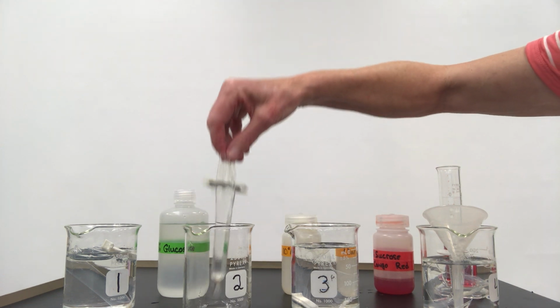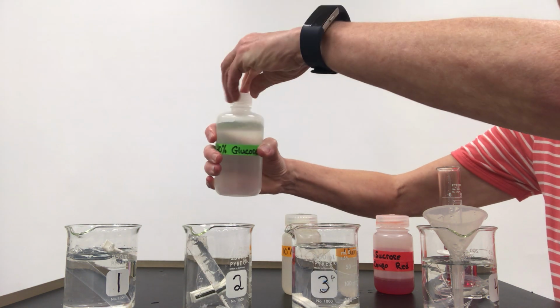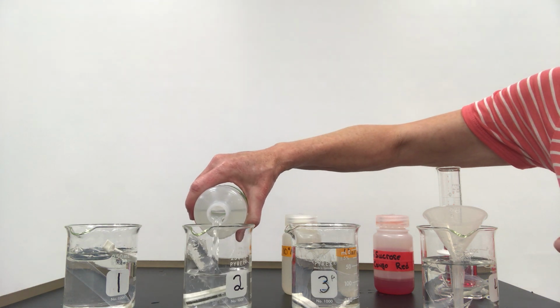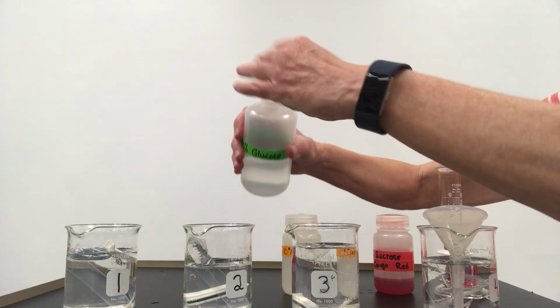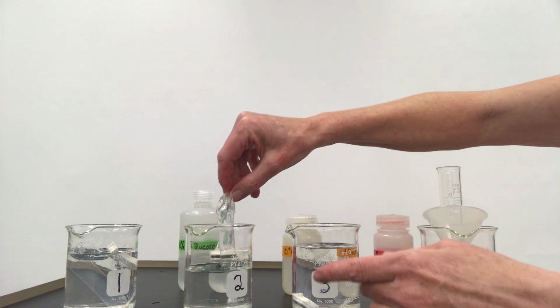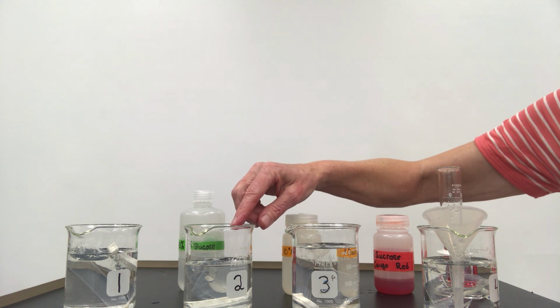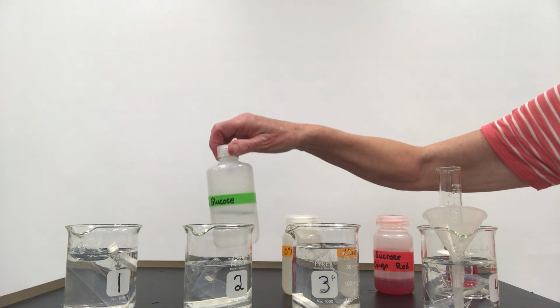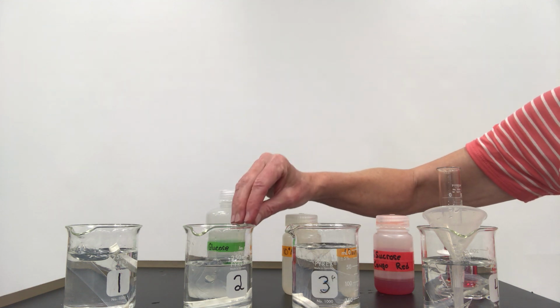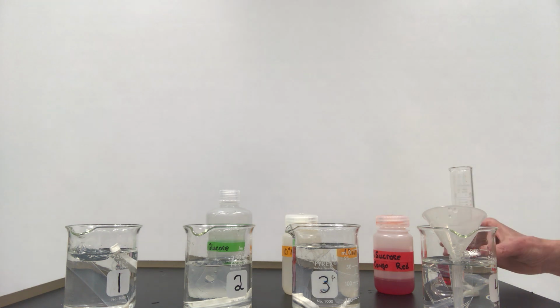The second sac we have filled with 40% glucose, and we are going to surround that with 40% glucose. So we're going to put that in the beaker, and we're going to leave it to run for about an hour and a half, and we are going to evaluate whether the sugar moved in or out, whether the sac has gained weight. We've weighed this sac prior to the beginning of the lab. We'll weigh it again. Now this is representative of an isotonic solution because it has the 40% glucose inside the cell as well as outside the cell. So ultimately we should see no real net change in weight because there is movement into and out of at the same exact rate since it is isotonic.